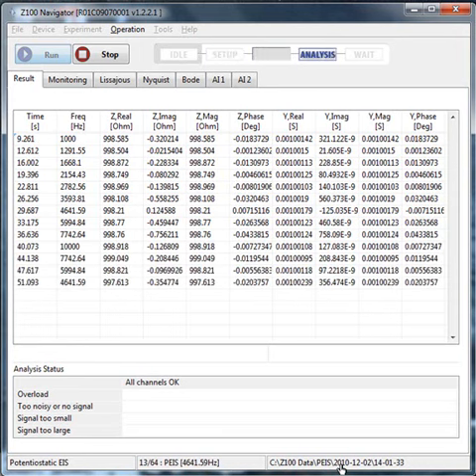You can follow the measurement by looking at the tabs along here. The result tab displays the numerical impedance values measured and computed at each frequency.